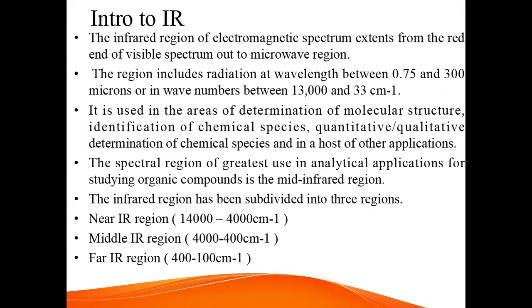The spectral region of greatest use in analytical applications for studying organic compounds is the mid-infrared region. The infrared region has been subdivided into three regions, which are the near infrared region, middle infrared region, and far infrared region.